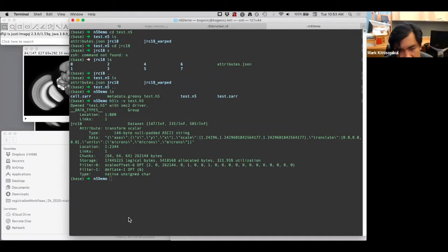I think the current NGFF specification assumes that within the same group, the arrays would be pretty similar or something like this. Is that the problem? Well, the problem is that there is no declaration of metadata for the individual arrays. It's all at the group, which can be nice if you're trying to minimize the number of pieces of metadata you touch.